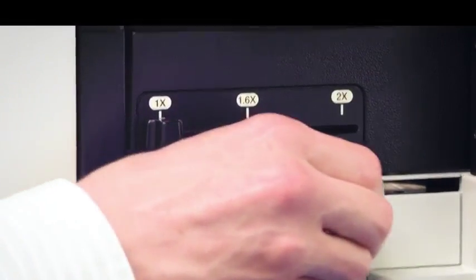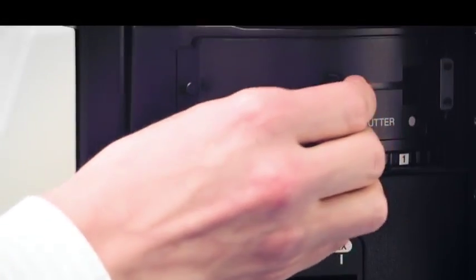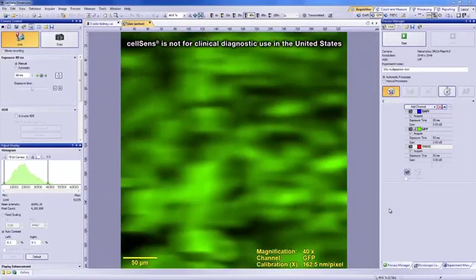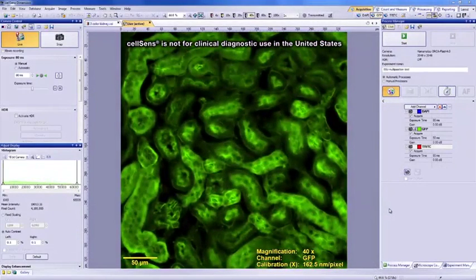With the Olympus IX-73 Inverted Research Microscope and Olympus CellSense software, the user has the power to design a research microscope system where intuition is a built-in feature.